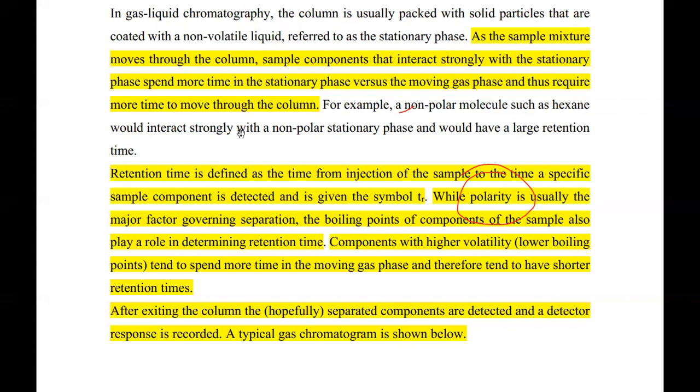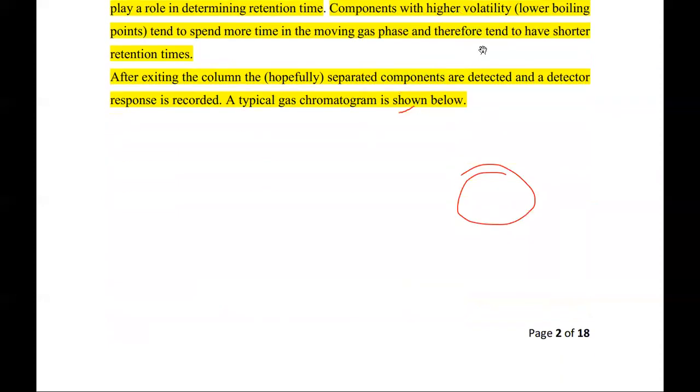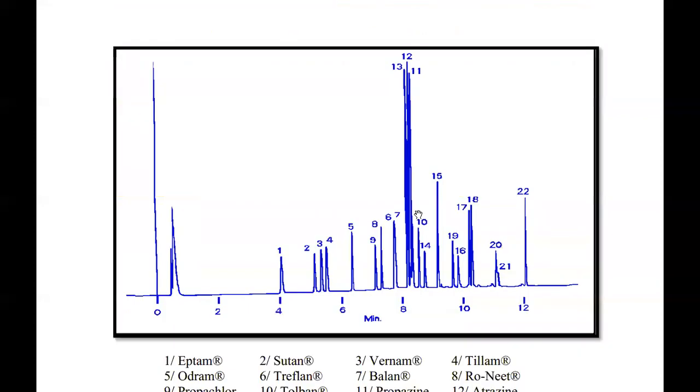So when you hear of solubility, they're talking about the substance. If both of them are polar, they're able to dissolve. And if one is polar and the other is not polar, they can't dissolve.